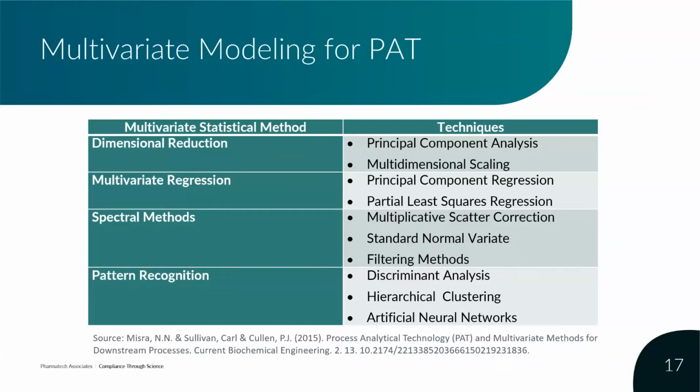but I do want to focus on a couple of the most common, which are principal component analysis and partial least squares regression. These you keep seeing over and over again. They're constantly being used. They're very robust. And the problem that you run into is that data sets obtained from these spectroscopic tools are often very highly correlated or collinear with multiple other variables.